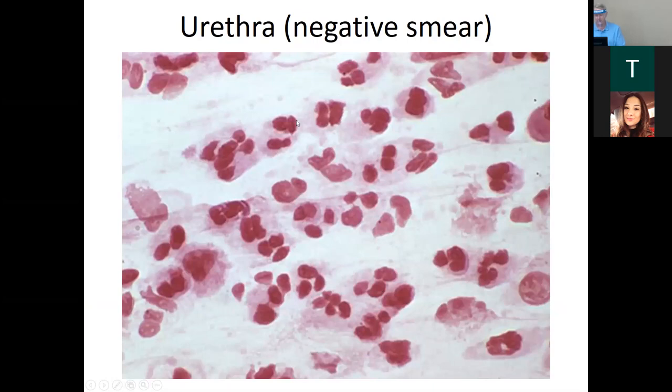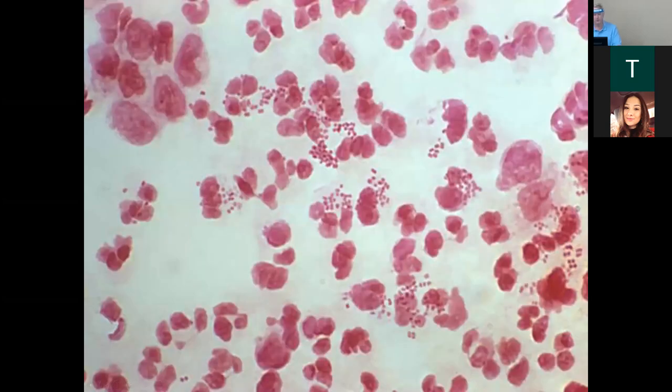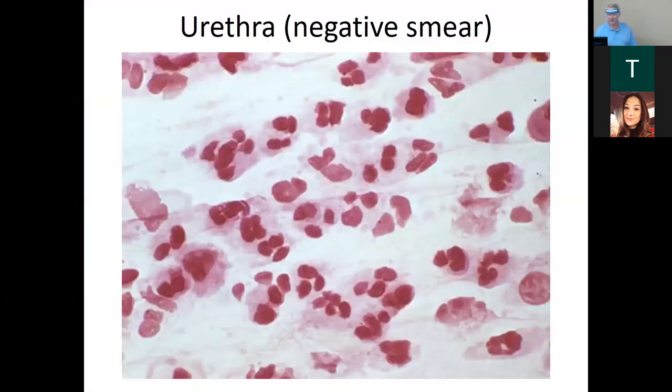So basically what this is, a negative smear, okay? We see a bunch of white cells, but we don't see any bacteria. We put this one up for those that are going into clinical. When you do your clinical, this is part of the clinical review. I put this slide up and I go, what do y'all see?